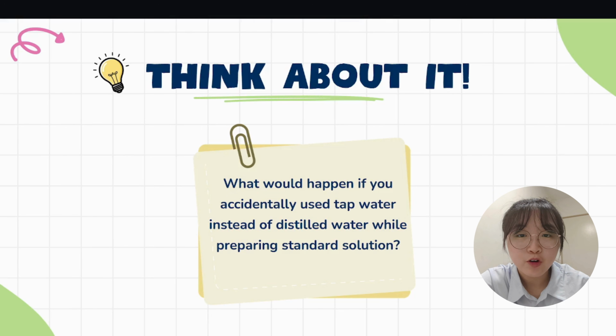And before I end this session, I have my very last question for you, which is, what do you think will happen if you accidentally use tap water instead of distilled water in preparing your standard solution? Would the concentration be affected, or how would it impact your experiment? So think about it.